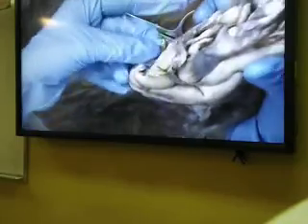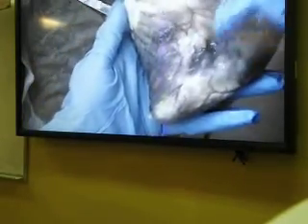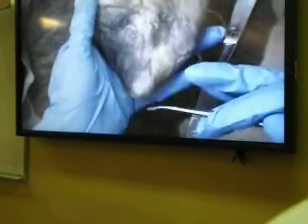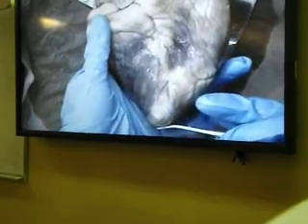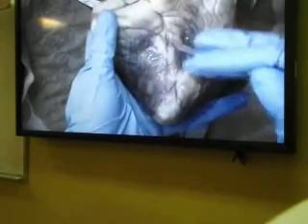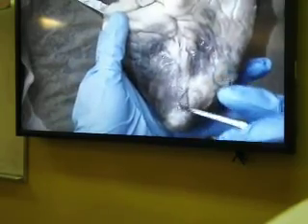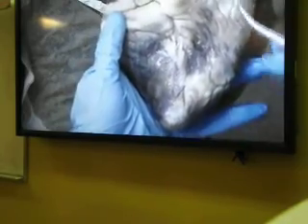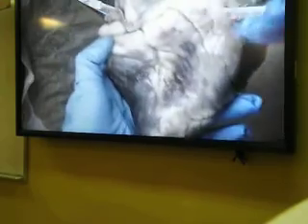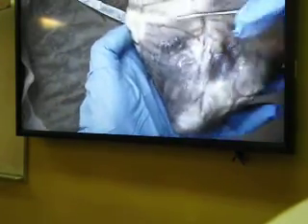This is my left atrium right here, and so this has to be the left ventricle. And again, this is the base, apex of the heart, and this is the posterior interventricular sulcus. Apex, posterior interventricular sulcus going almost to the apex, and right atrium, right ventricle, left atrium, left ventricle.